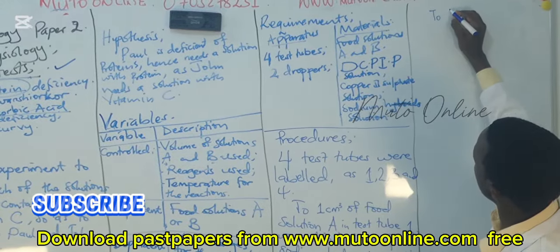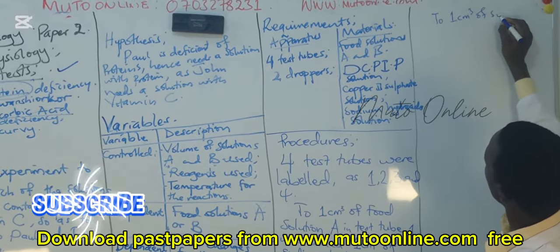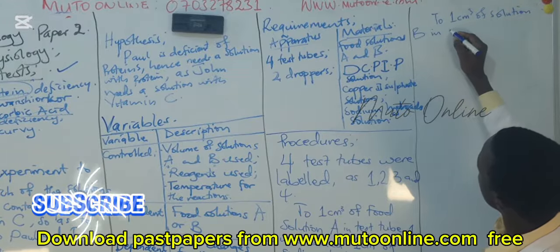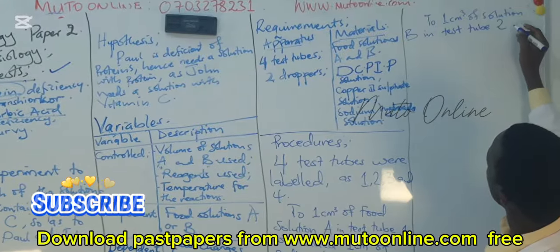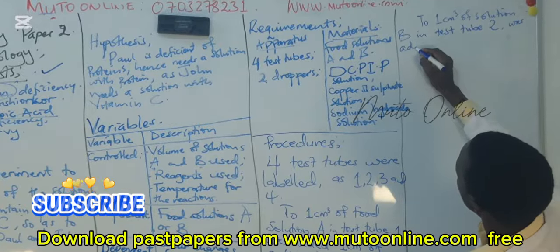Again, to 1 cubic centimeter of solution B in test tube 2 was added.